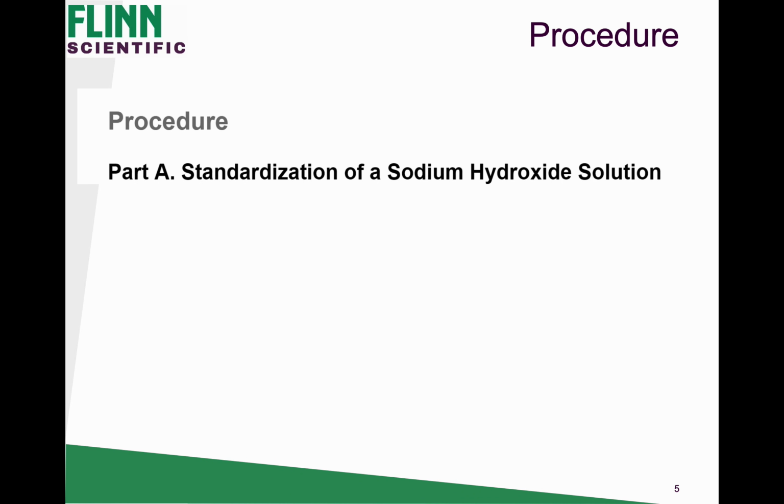All right, so the very first thing we're going to watch is the standardization of a sodium hydroxide solution. I'm not going to show you the videos that are embedded in this PowerPoint within the screencast. I want you to stop the screencast, go to the PowerPoint, and watch the videos that are embedded in there. Once you've watched this video on the standardization, stop it, come back to the screencast, and we'll keep going from there. Now, the sodium hydroxide is going to be what is put into the burette. It's going to be the titrant.